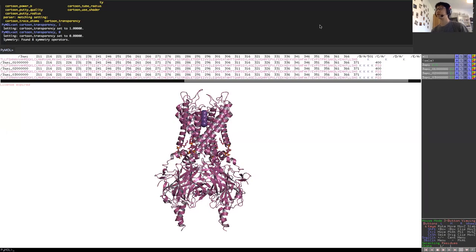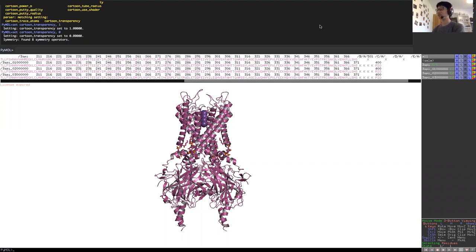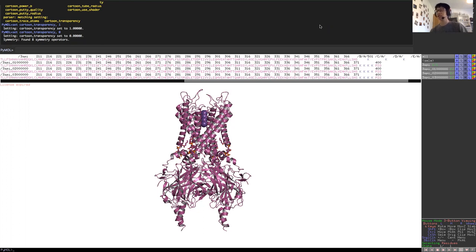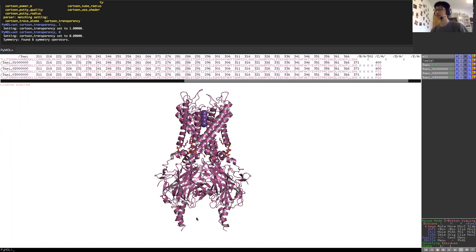In this tutorial, we will be continuing on a theme of inwardly rectifying potassium channels and we will be looking at residues surrounding the ligand binding site. Here we have a structure of a KR 2.2 channel 3 SPI with PIP2 bound in their binding site in the crystal structure.